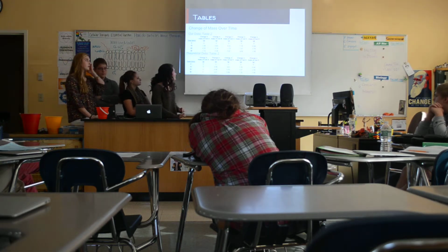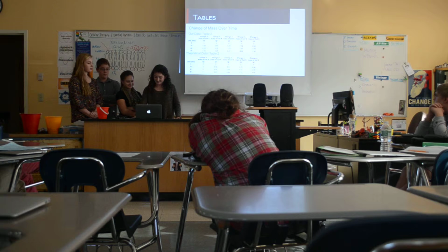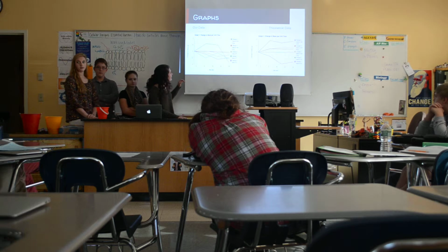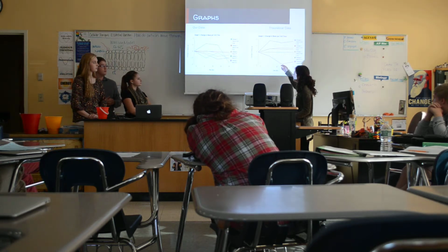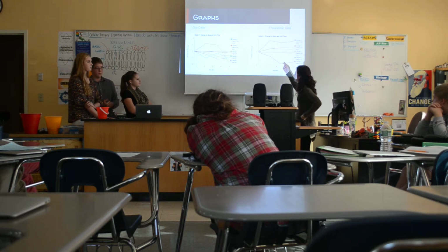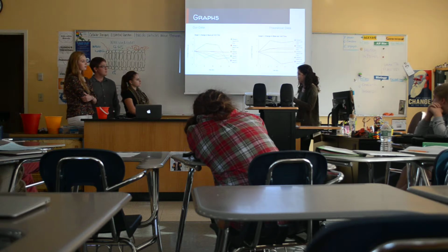So this is the actual change over time, not just the numbers. So you should probably look at the theoretical data because that's right. And so the graphs, the reason that this purple line goes down is because it lost mass, right? But then all the other lines go up because they gain mass. And this green line is opposite of the purple line because the beaker and the cell concentrations switch at the beginning.